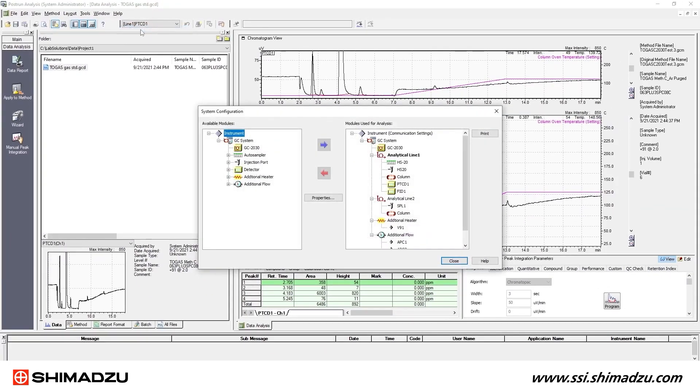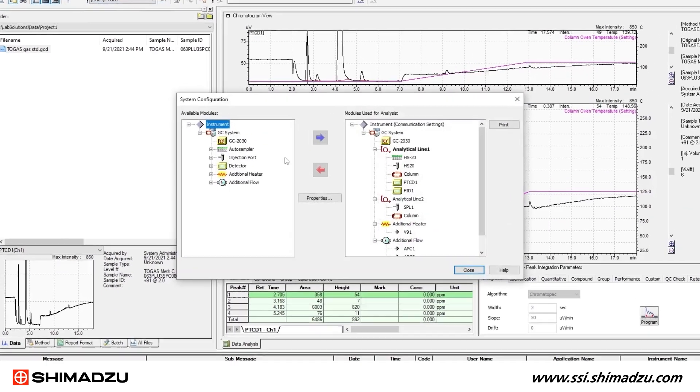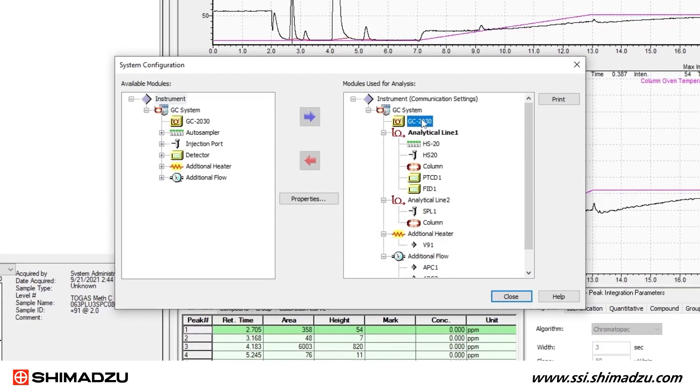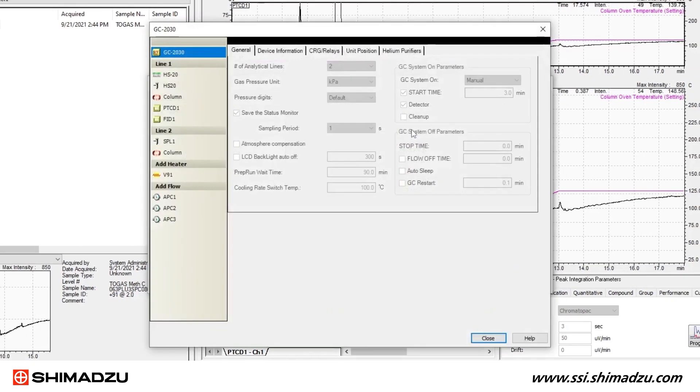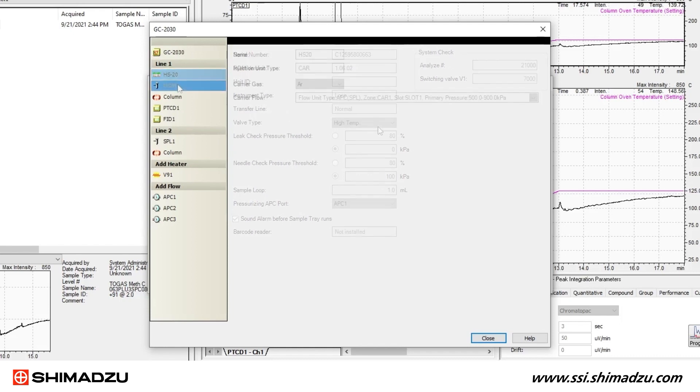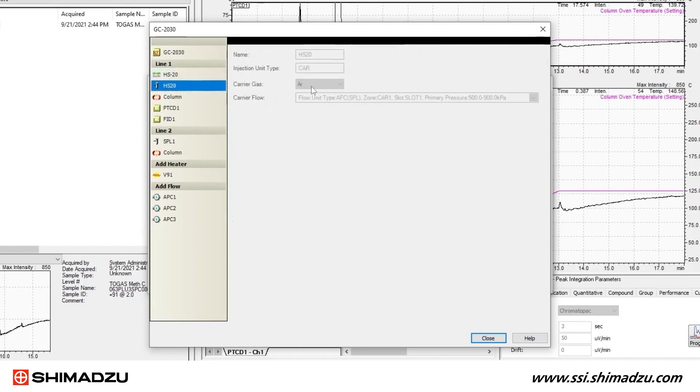The System Configuration window should open. You will see the hardware modules that were used to acquire the data in the file you selected. Click through each item to view the detailed settings for each module. Record all of this information in a notebook.